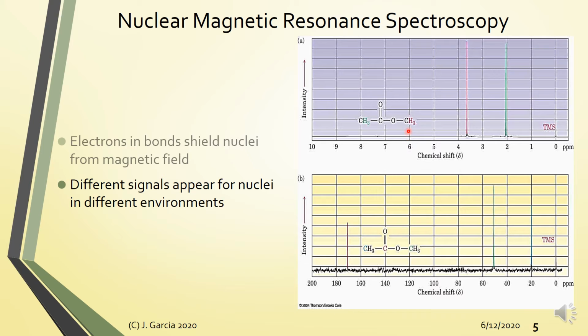So here, in the case of methyl ethanoate, yung methyl na ito is more upfield. So bakit more upfield yan? Because the carbonyl group tends to pull away the electrons, okay? But not as strong as the oxygen atom itself. We expect that oxygen bonded to this carbon will have a stronger pulling power compared to your carbonyl functional group. So since mas deshielded itong protons dito, mas downfield yung signal niya.